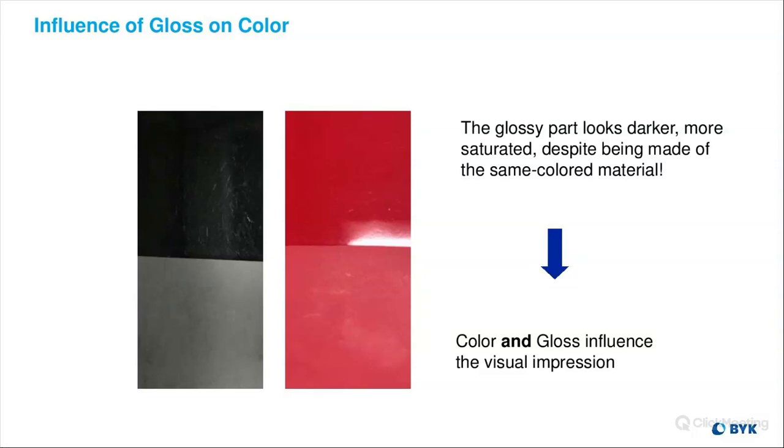But we actually have this other instrument, which is pretty cool, and it measures texture. It's called the Spectra Two Profiler, and it's almost like a 3-in-1. So it'll take measurements of the color, it'll take measurements of the texture, and it'll also take measurements of the gloss, and almost create a 3D topography of what you're looking at on a micro scale.